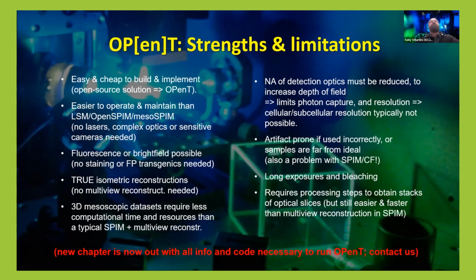even if you build your own light sheet setup. It doesn't really require lasers. You can use just an LED. It doesn't require complex optics. Cheap optics is what you need. Actually, low numerical aperture optics is typically what you need. And if you're doing transmitted, you don't even need a sensitive camera. But if you do fluorescence, you can do fluorescence, autofluorescence with really cheap cameras.